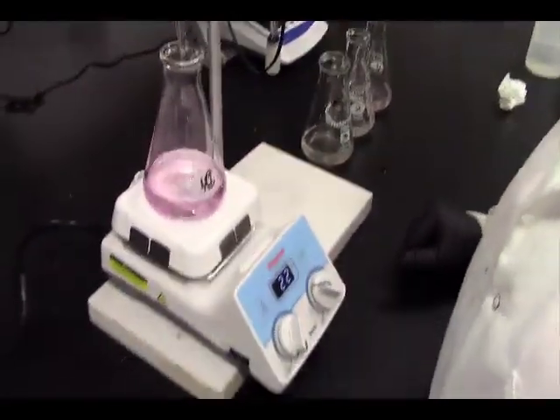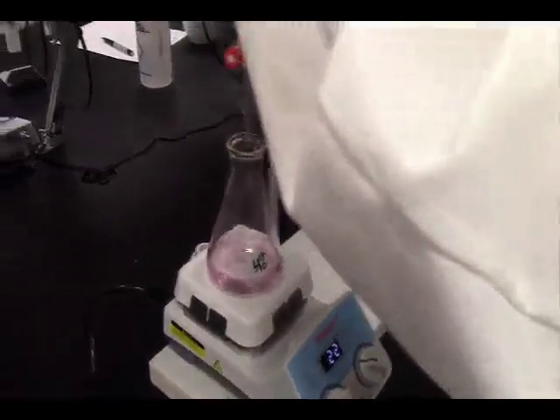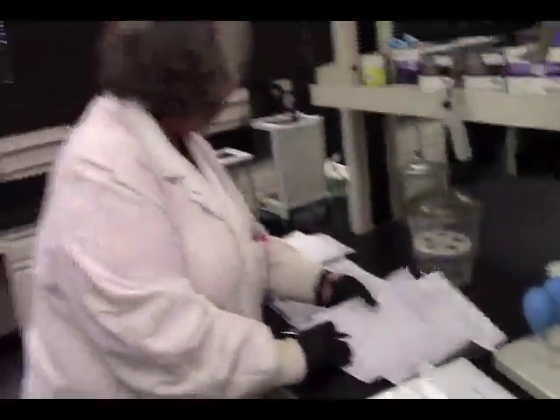There we go. Pale pink. All right, we're going to read our burette. Nine point six two. Yeah, 9.62. All right, now let's meet at the board for our calculations for this.